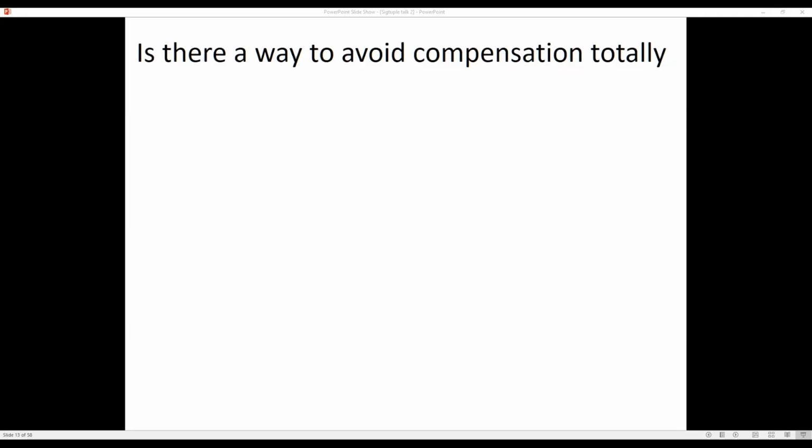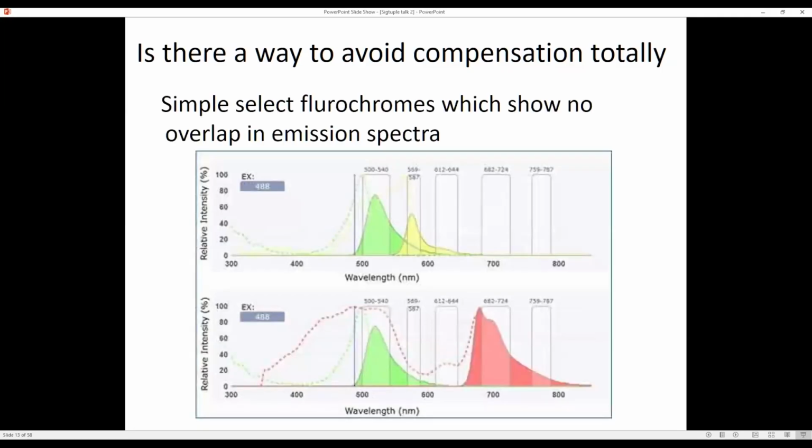I'll show you that. We also have Lena on the chat who's saying choice of fluorochrome. Yeah, choice of fluorochrome, obviously. And Dr. Satya was saying we can do it by selecting the markers based on the expression. Markers have nothing to do with it. Compensation and spectral overlap have nothing to do with the antibodies, as I said earlier, right?